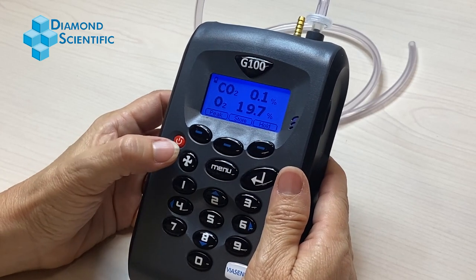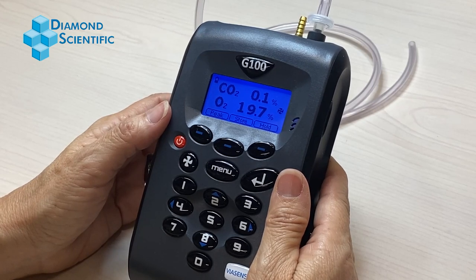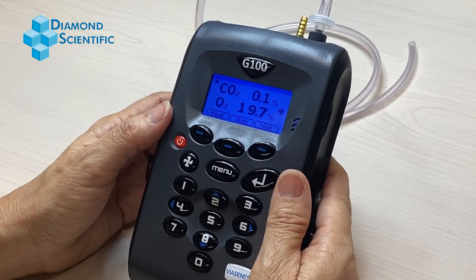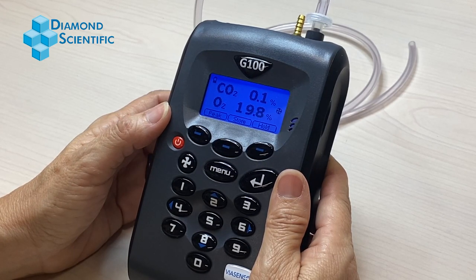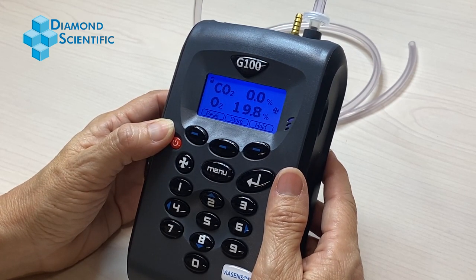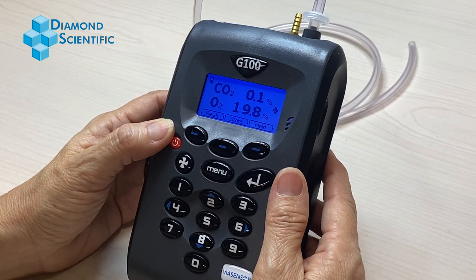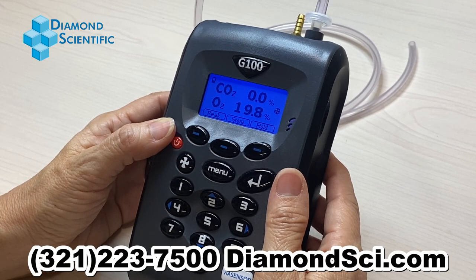Exit the menu and turn your fan on. If it still fails, repeat these steps for fine tuning. If you reach positive 16 and the unit still messages a flow failure, the unit should be submitted for factory servicing. If your instrument needs calibration or servicing, contact Diamond Scientific at 321-223-7500 or reach us through our website at diamondsci.com. Thank you.